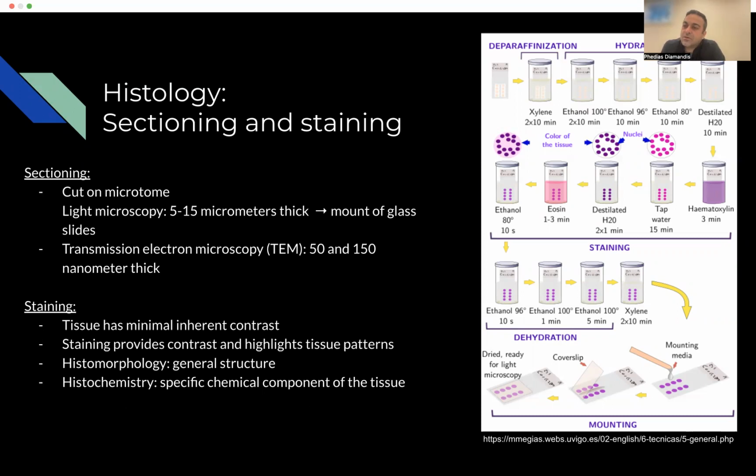There's a step called differentiation, where you rinse the stained product with water. This will turn some of the purplish to a more bluish color, which is what we tend to see under the microscope as a final product. So that's called differentiation.